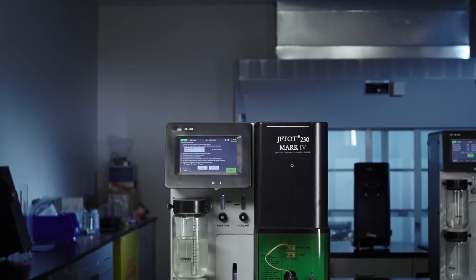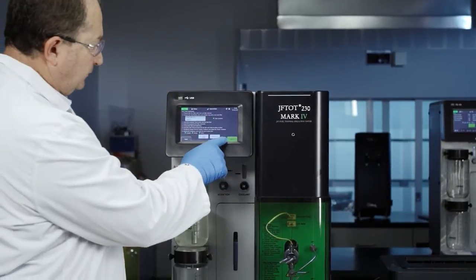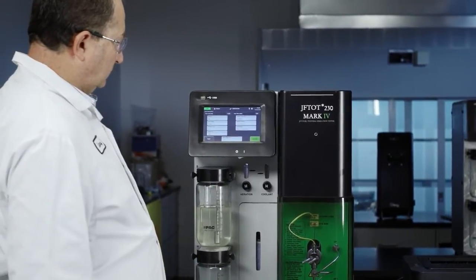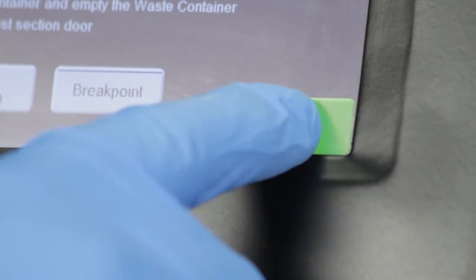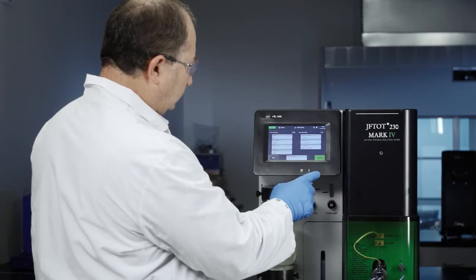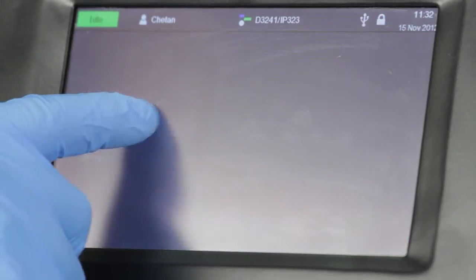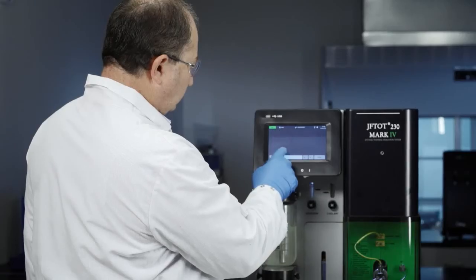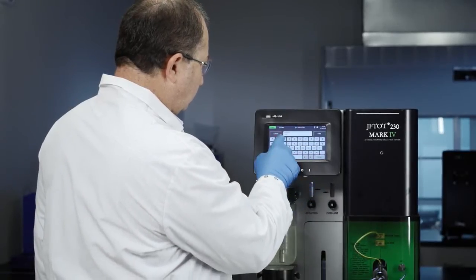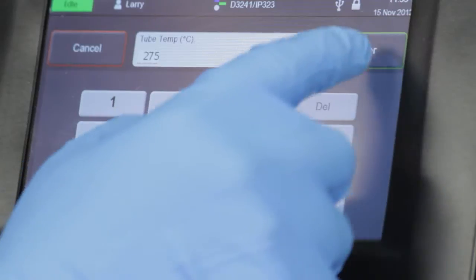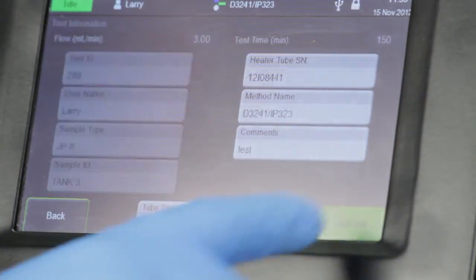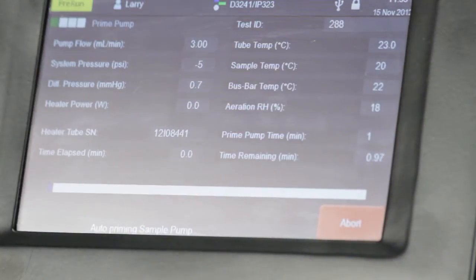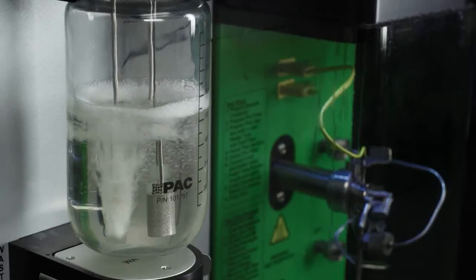You've now set up the JeffTot 4. Now you can start the test, which will only take a few more steps. The first step is to press the next button. Once you do this, the test information appears. On this screen, the user will enter the test information for the sample and select the test method. Once you get all the information entered, press the Start Test button. The JeffTot 4 will prime the fuel pump automatically and then start the aeration process.